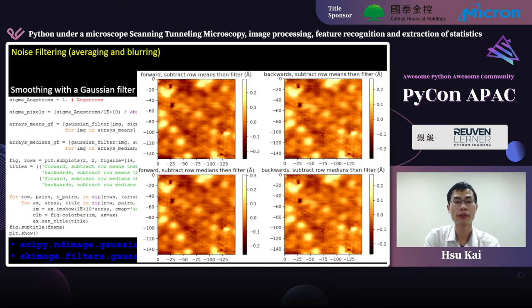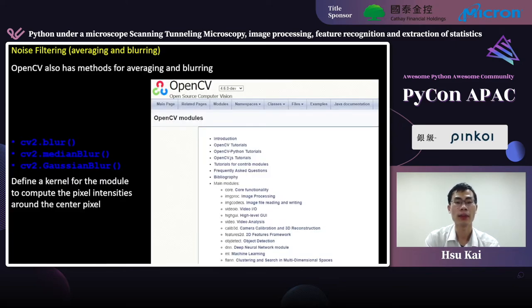So, with Gaussian filter, we actually smooth out the data, or blur the image. OpenCV also has methods for averaging and blurring. The only thing that we have to do is to define something called kernel, which is a number of rows and columns. We define a kernel so the function can compute the pixel intensities surrounding the center pixel, and then assign a new value to the center pixel.